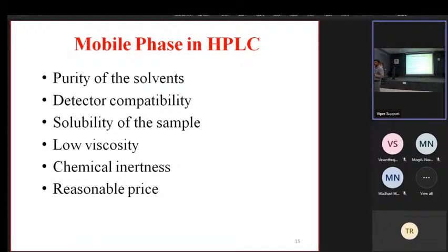That is the quality or purity of the solvents, because we are running all these mobile phases through the column. The column has very sensitive stationary phases. If the solvent contains impurities, they will clog the column, and the column will spoil. If you accidentally run with some other laboratory grade solvent, that also affects the column. Some contaminants we can wash from the column, but others bind irreversibly, permanently. That's why we always use a pure, HPLC grade mobile phase system.